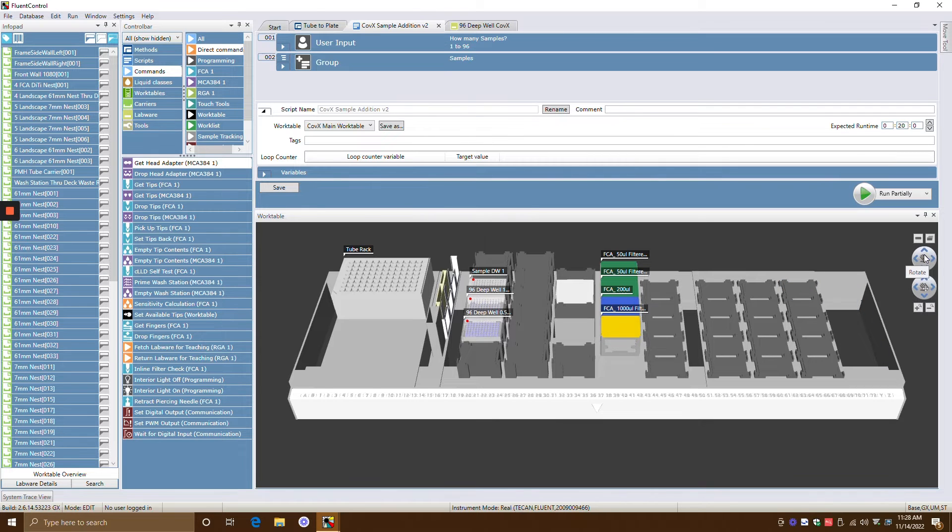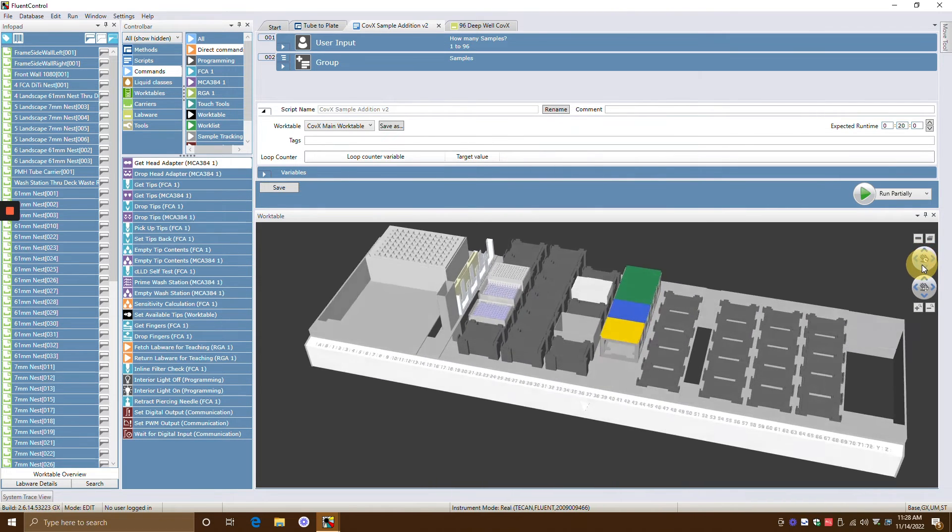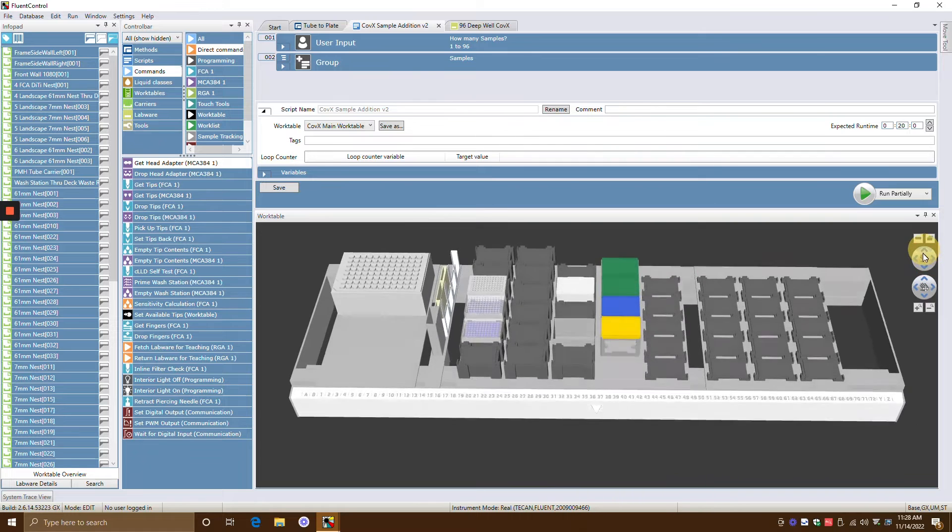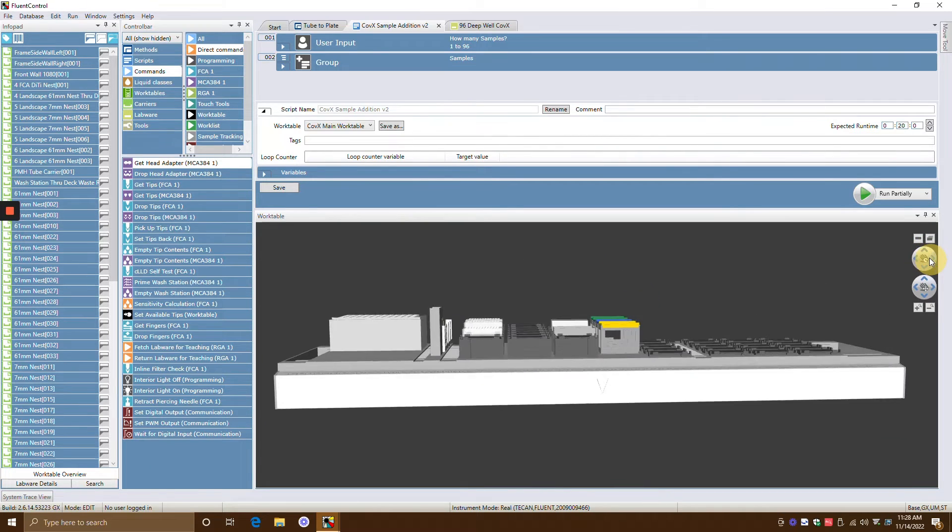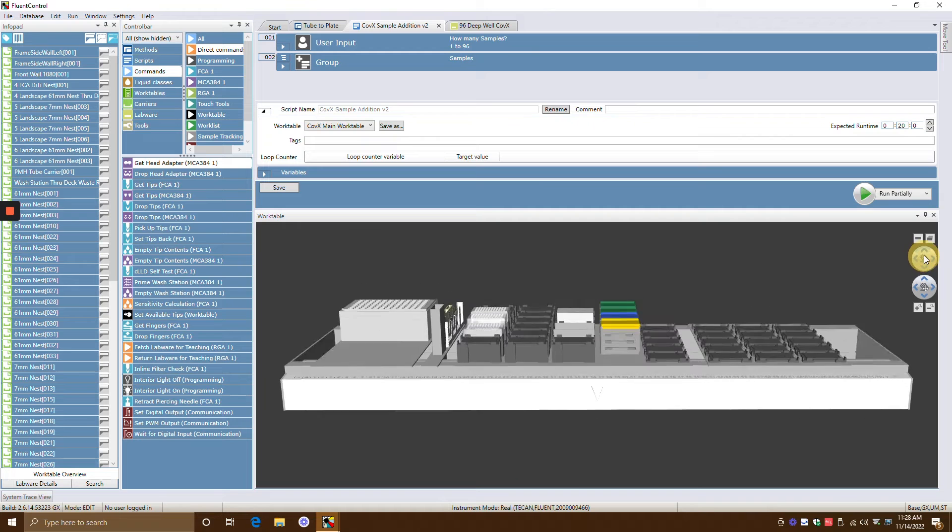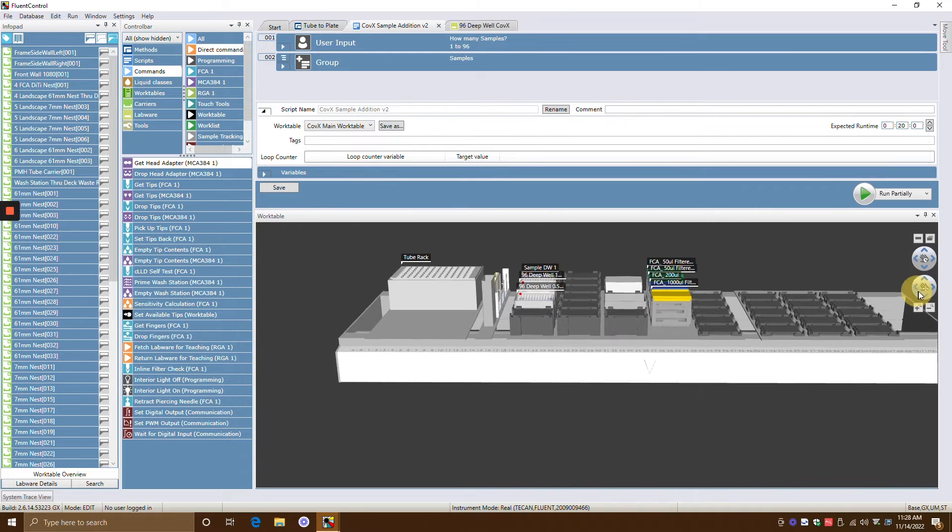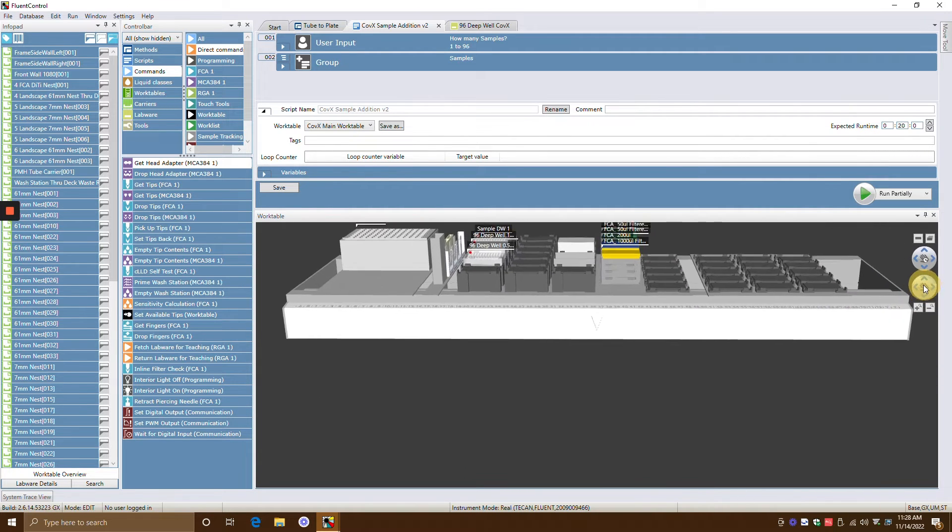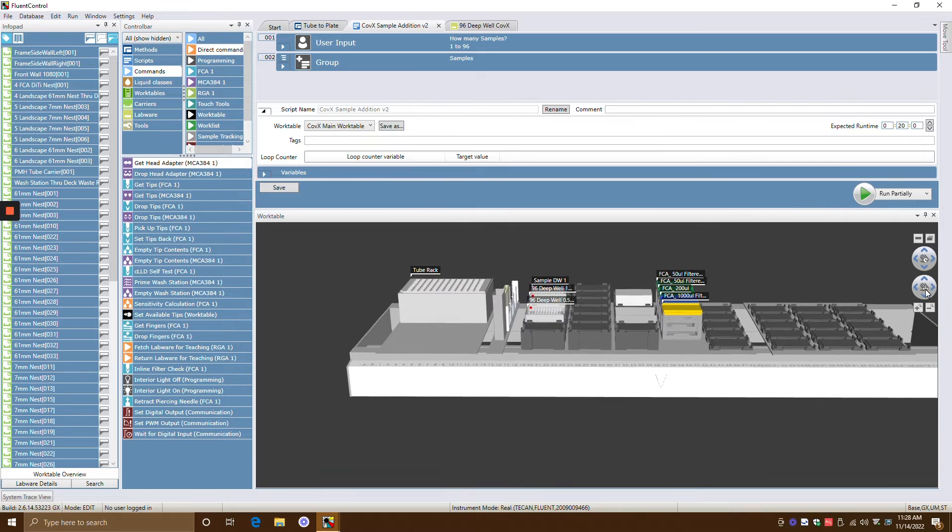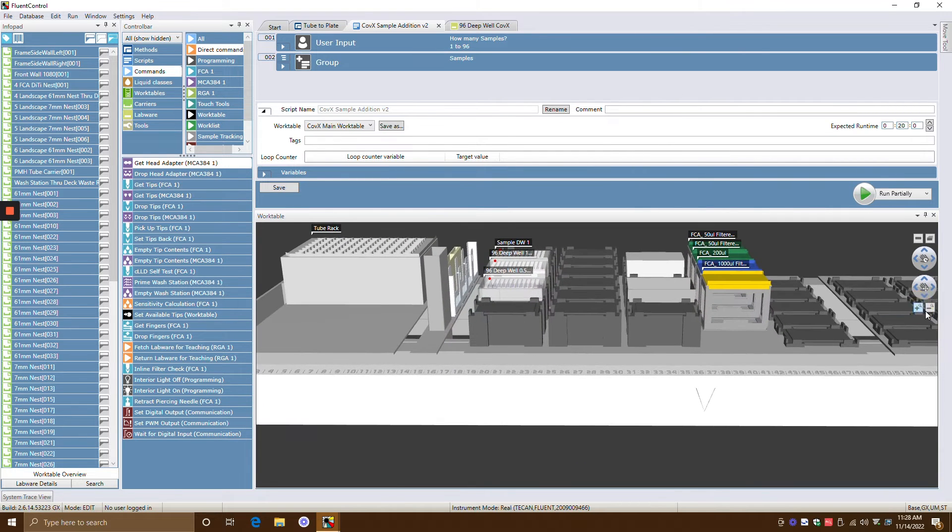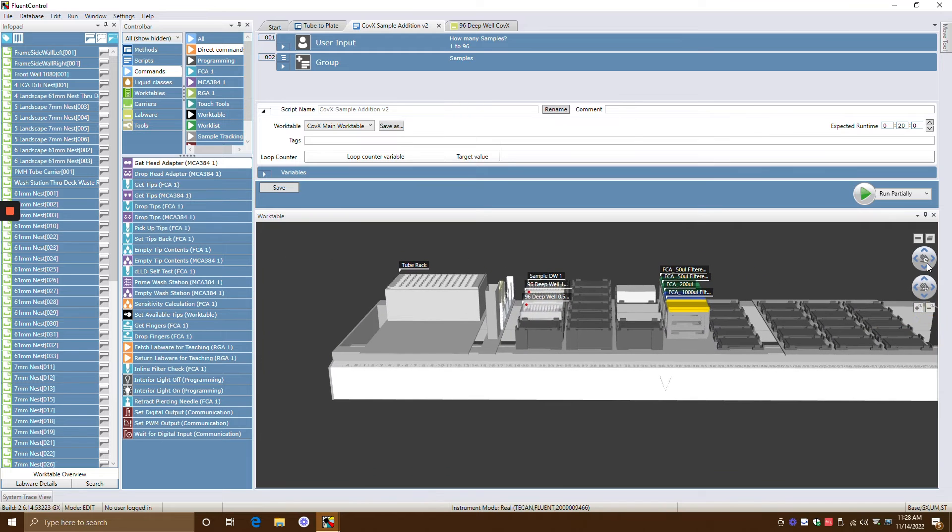This is the rotate. So sometimes if you want to be able to rotate up and down and left and right to kind of see your work table a little bit more clearly, that's what it is. This is the pan. This is just left, right, up, down, but you're not really rotating anything. And these are your zoom buttons. So this is the zoom in and this is the zoom out.